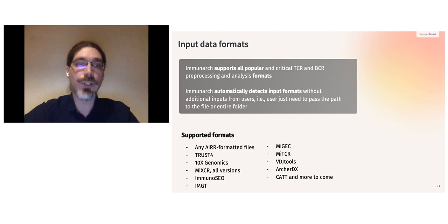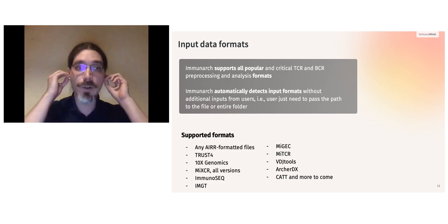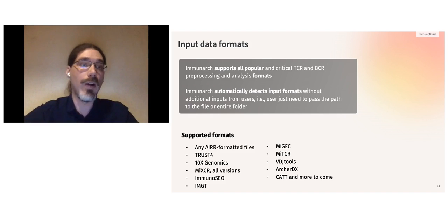It's the well-known TRUST4 or 10x Genomics or MiXCR formats. And of course, it's an AIRR format support too. And we plan to implement some of the other file formats in the future, such as CATT.